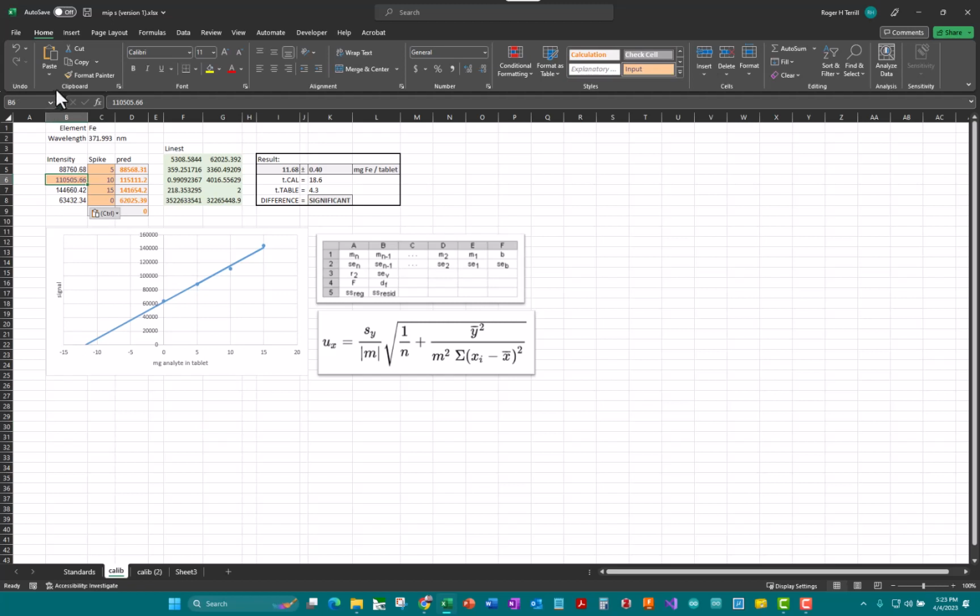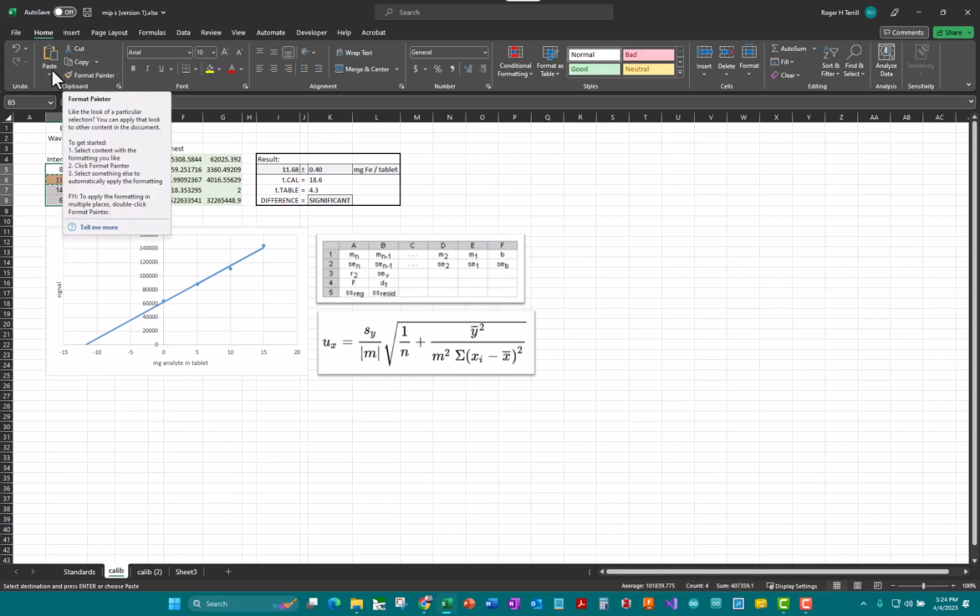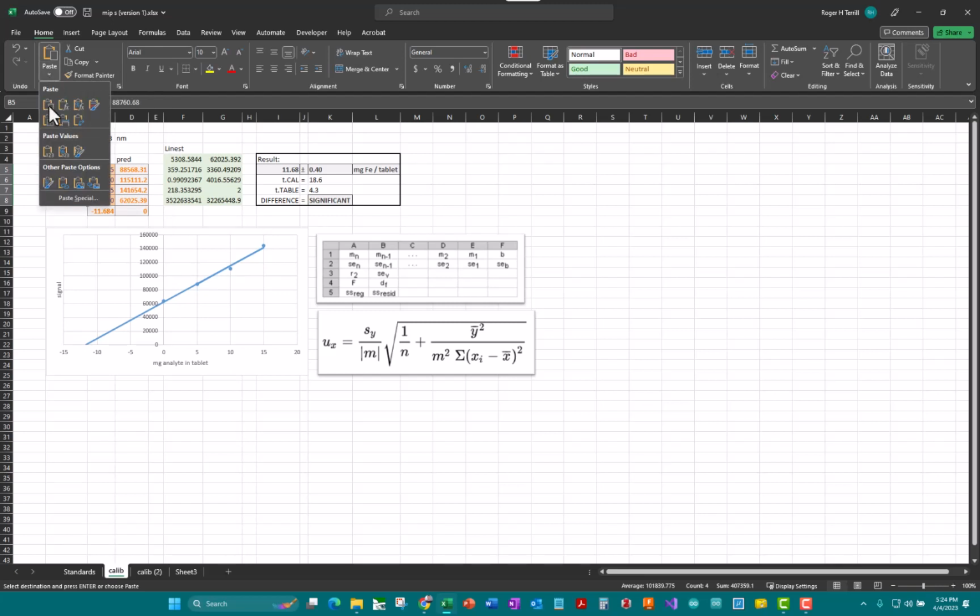We can copy just the, we'll copy that, and then I'm going to paste the formats here. Paste special formatting. There we go. So I didn't change any numbers, I just changed the format. So this all works out, and this is all we needed to do because these numbers are all the same.